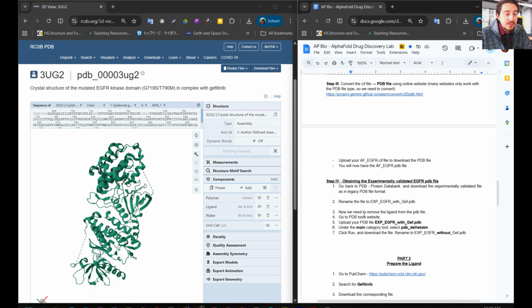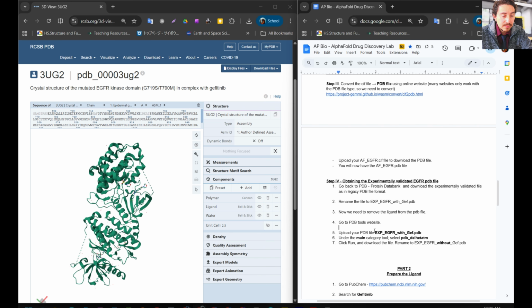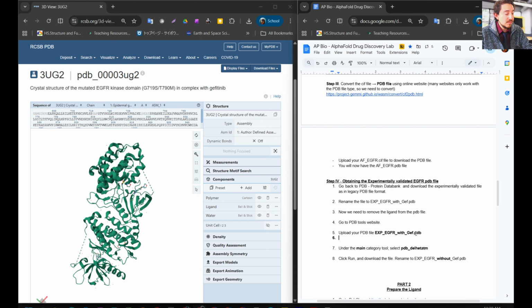So the way that we do that, let me just fix that. I needed to add an additional step. Oh, sorry, I do have it here.